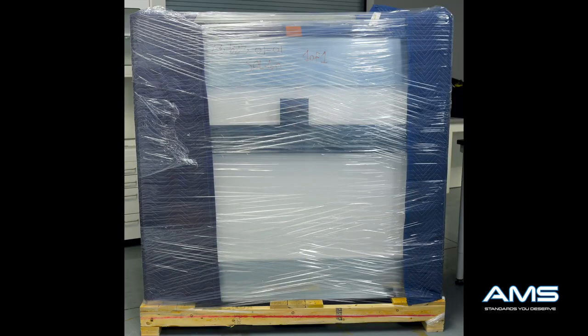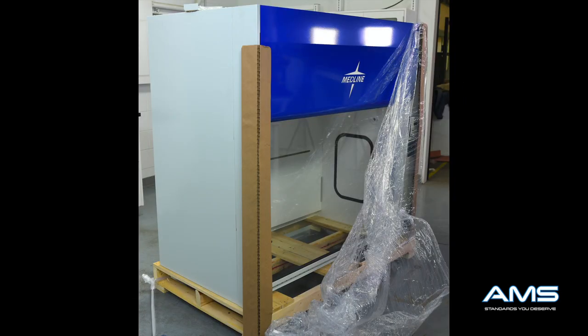Be sure to leave the fume hood on the skid until instructed to take it off. We recommend placing the fume hood as close to the desired final destination as possible to create a minimal amount of lifting. When you first receive your fume hood you will notice it is in robust packaging. Remove all the cellophane as well as the blankets down to the undercoating layer of protective barriers, and remove all of these edges.